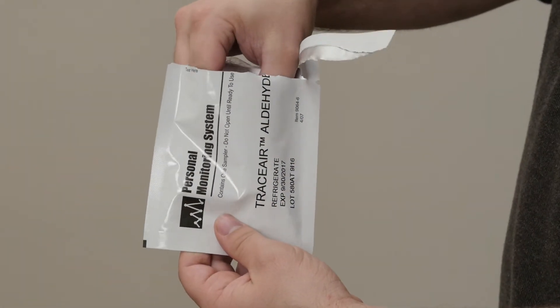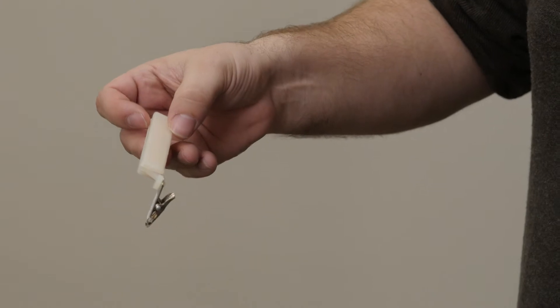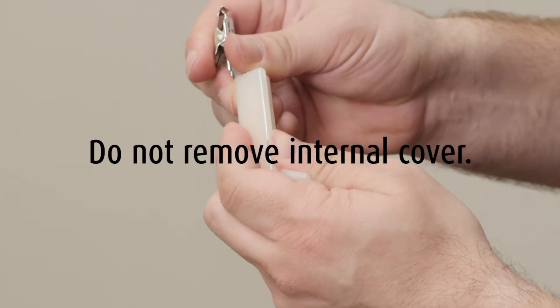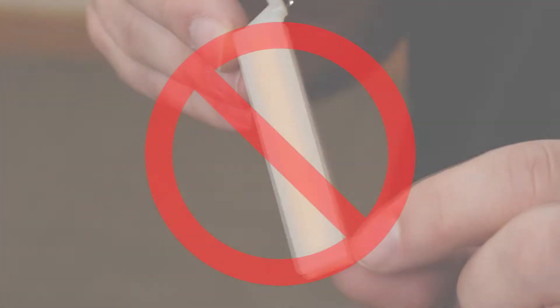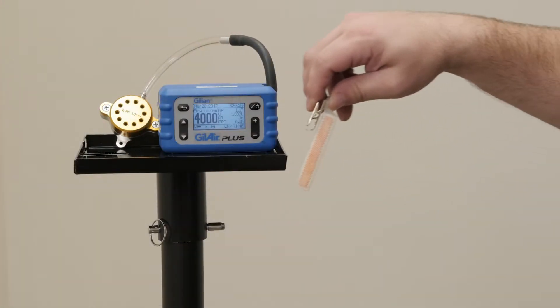Locate the SA580 badge and remove it from the pouch, and discard the pouch completely. Remove the monitor covers by lifting the outer cover from the end opposite the collar clip. Be sure that sampling holes are visible. Do not remove the internal cover. Remove both covers for a 4-hour sample, then clip the badge to the sampling tray.